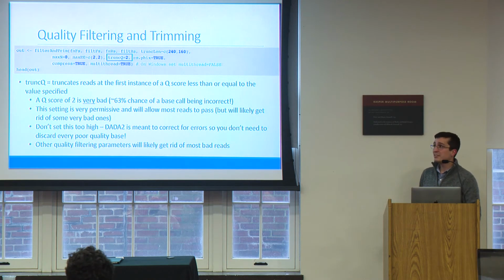You could increase it, but the nice thing about DADA2 is that you don't have to go crazy trying to get rid of every single sequencing error that you have. Since DADA2 will account for those errors, you can kind of just let your data run through the pipeline and not worry too much about it.